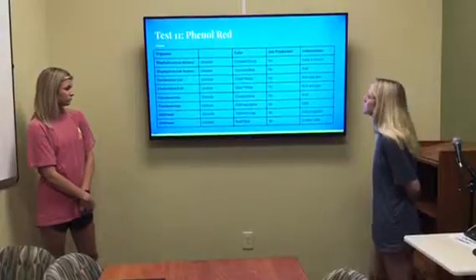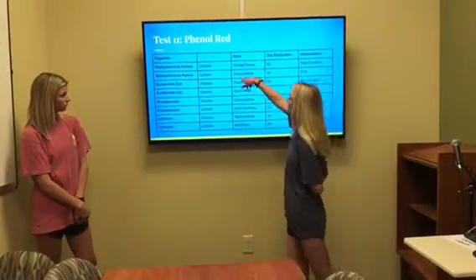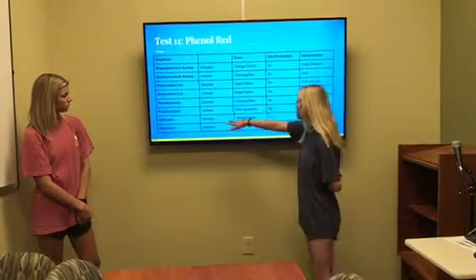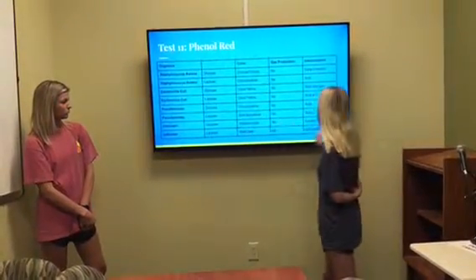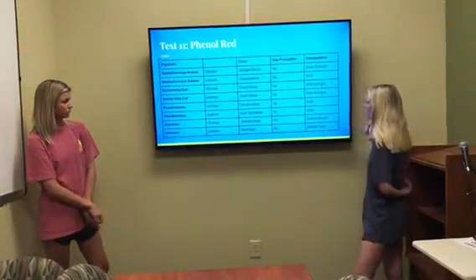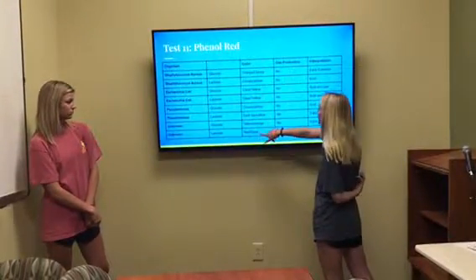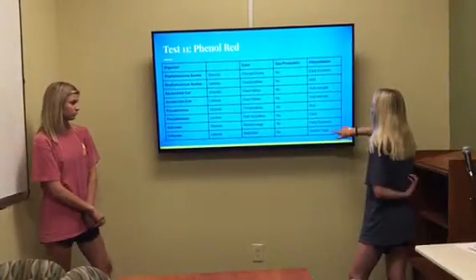And so for this test, we tested all of these bacteria, and for each bacterium, we tested glucose and lactose. And then for our unknown, for the glucose, the color changed to yellow-orange, and there was no gas production, so that means it's early reversion. And then for the lactose, the color was red, like a red/clear color, and there was also no gas production, which means it's a control tube.